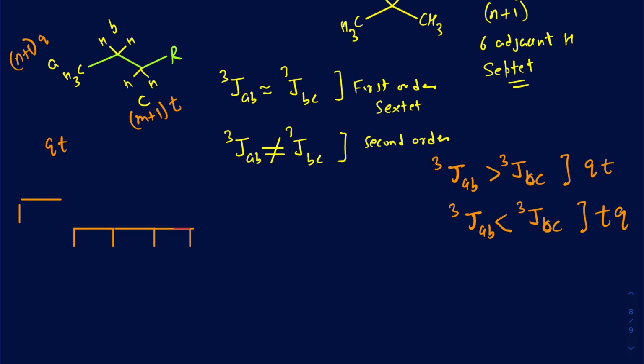So I'm trying to make sure that space is as equal as possible. I'm starting out with this HB proton, and due to the HA protons, so you have 3 of those, you're going to be seeing the 4 splittings there. So you're going to have the distance between those 4 here. That's going to be your coupling constant.